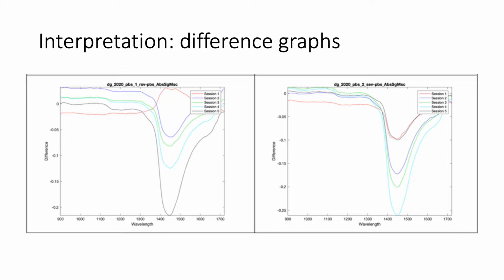In this study, we pre-processed the data before we modeled the data. For pre-processing, we used SNV to reduce the scaling differences between spectra. We used SG to remove baseline offsets. We used VS to select variables based on standard deviations. For modeling, we used PLSDA, which is the standard in chemometrics.